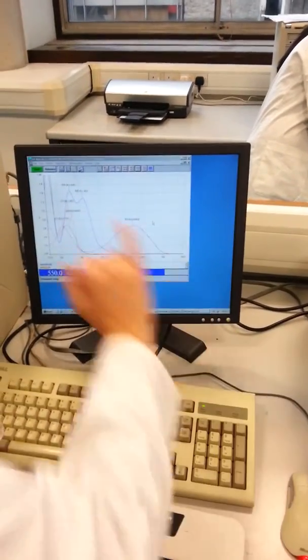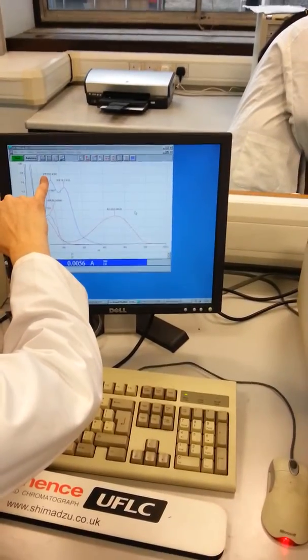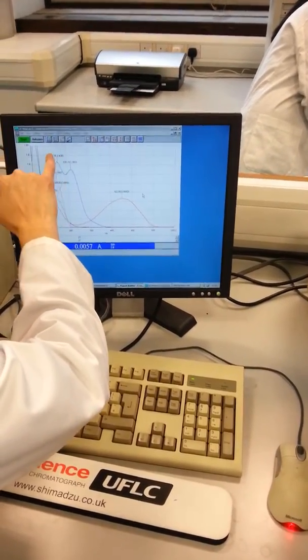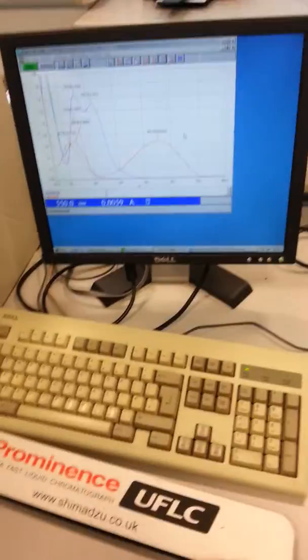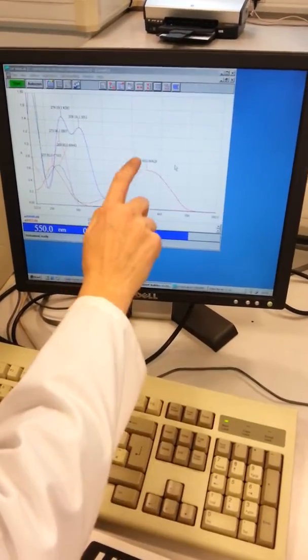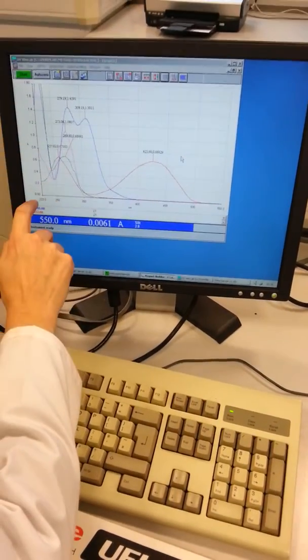Right, okay. So as you can see, that number's the wavelength of maximum absorption. 279 is a wavelength. And that's the absorbance at that wavelength. Let me write this down just to make sure I've got it right. What's the wavelength? The 279, the big number, because obviously that corresponds with those, and then that number, because that obviously corresponds with those.